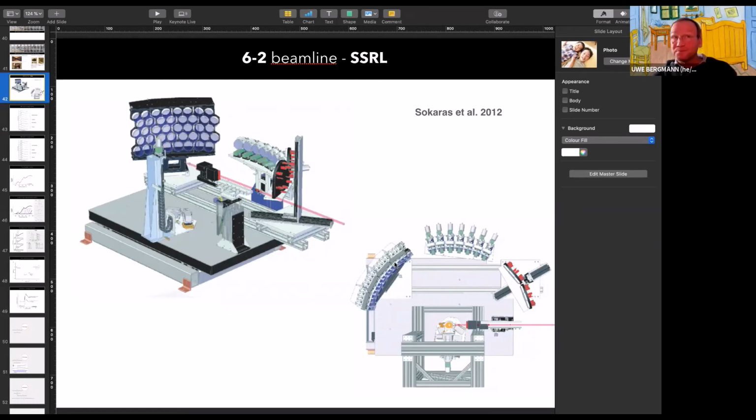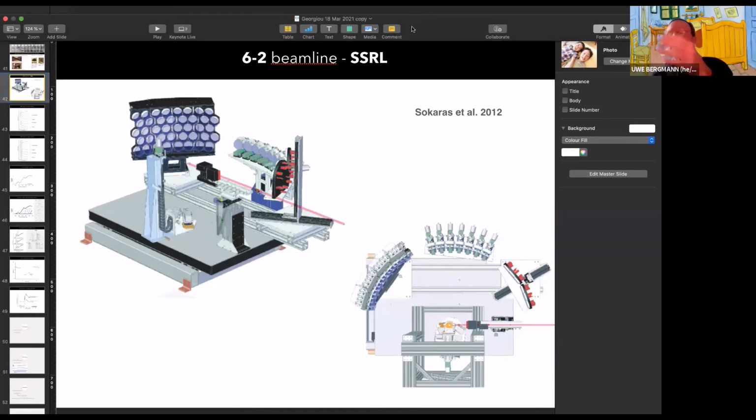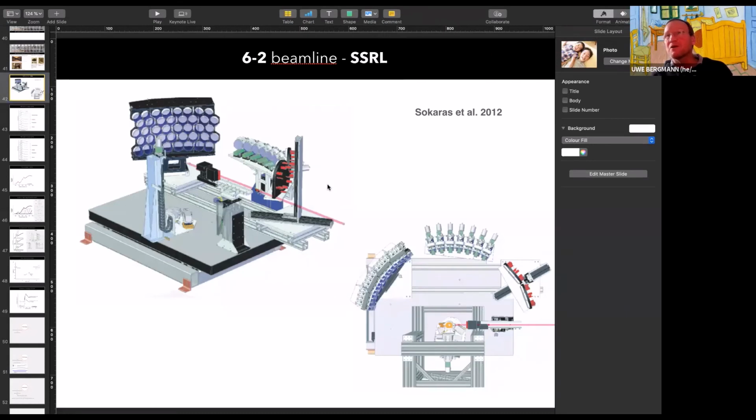I believe that there are two optimizations for these large solid angle Raman spectrometers, right? One way, and that's more the way SSRL goes. So maybe also a little bit of a long question about flux and brightness. I think if you only go for spectroscopy, you can do very well at pretty much many of the beamlines around the world if you have good high resolution analyzer crystals in particular. So we use these dice crystals. Their spectral resolution is really the key.